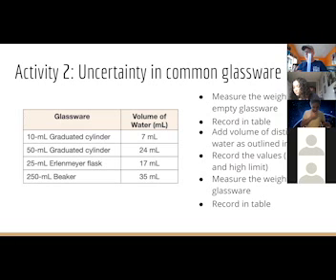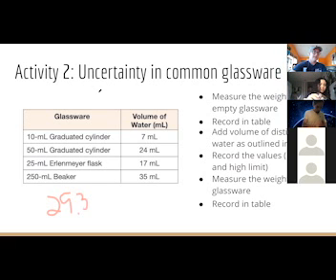We'll do that the same way. Just measure the mass before. So the mass of my graduated cylinder is 29.37 grams. Empty.